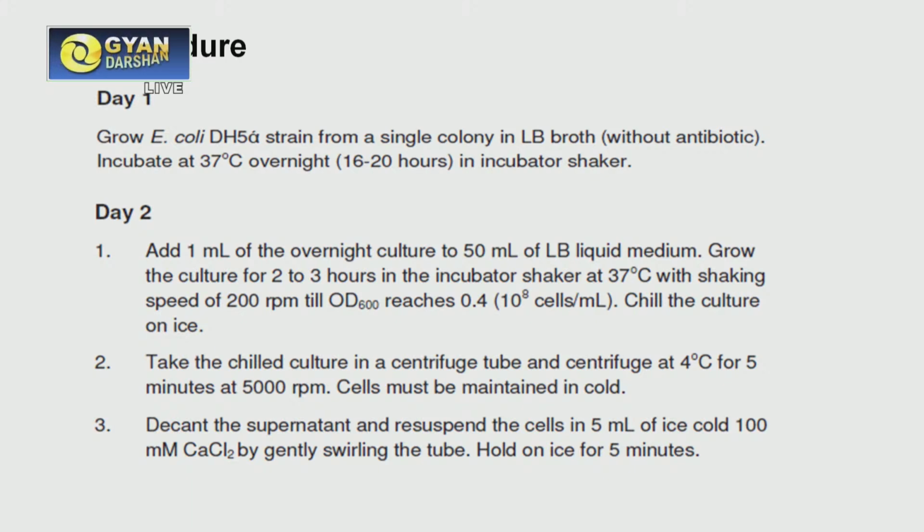In that case there will be a heat shock, and the bacterial cells will not be able to take up the DNA, because you need the cold treatment. Specifically, you need the calcium chloride cold treatment for creating the minute pores. And you cannot subject the bacterial cell to prior osmotic shock by exposing it to room temperature or high temperature.